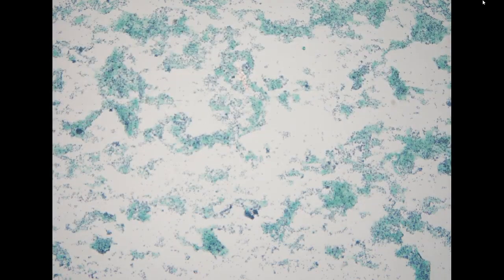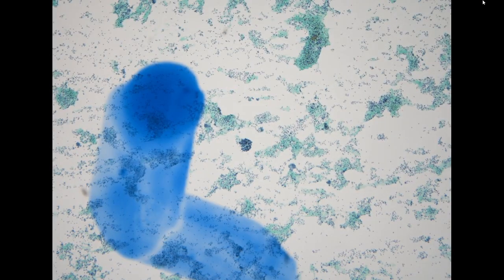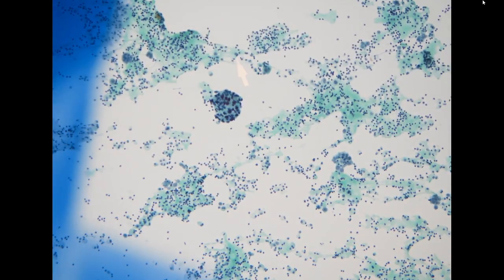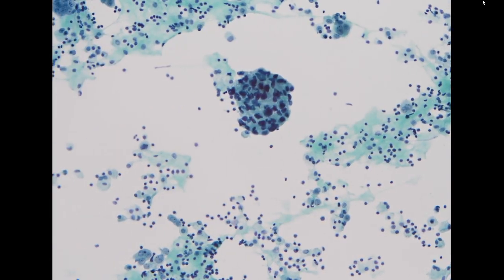Okay. Another pleural effusion. This is from a 65-year-old female, and this is a new patient. There's no prior history. In this specimen, we find some large cell clusters. On low power, you can already appreciate it is very hyperchromatic.